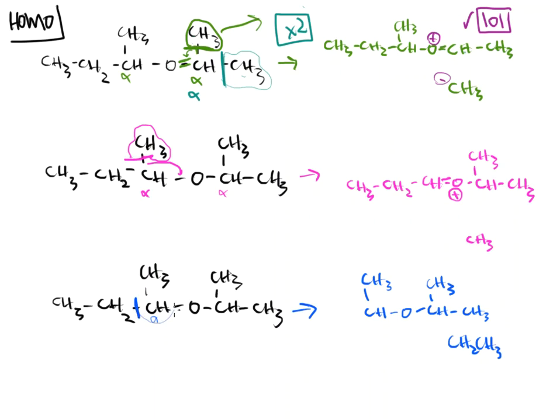These electrons move inward. They go to that oxygen. Again, electronegative. We get that double bond that gets formed there. And when that happens, that gives us the positive charge that will be seen by the detector. So this is my negative, and this is my negative. These do not get seen. I'm going to cross those out. And if I do the nominal mass weights of this fragment, 12 and 3, 12 and 1, 16, 12 and 1, 12 and 3, 12 and 3, what I would end up with here would be a fragment of 87.